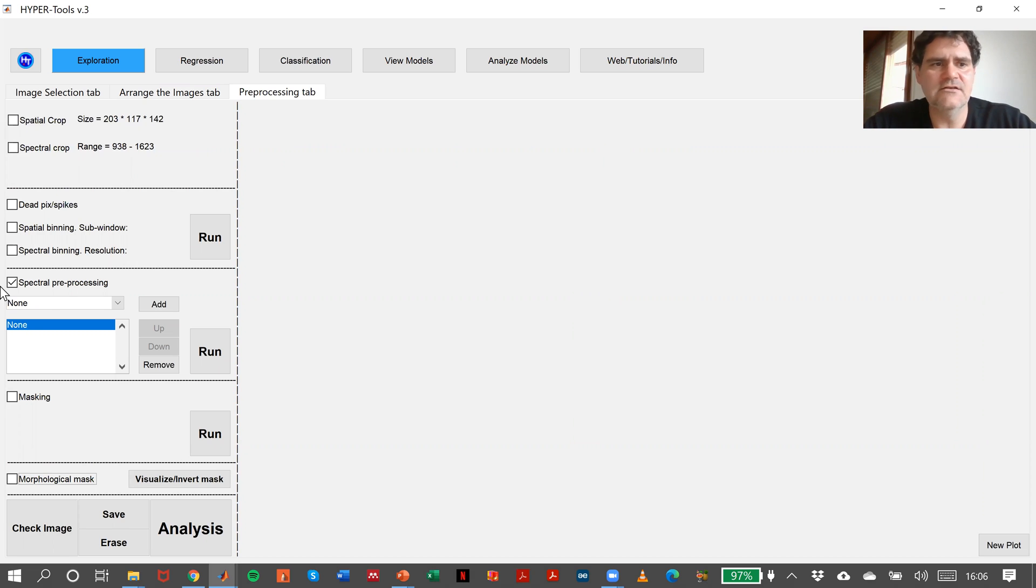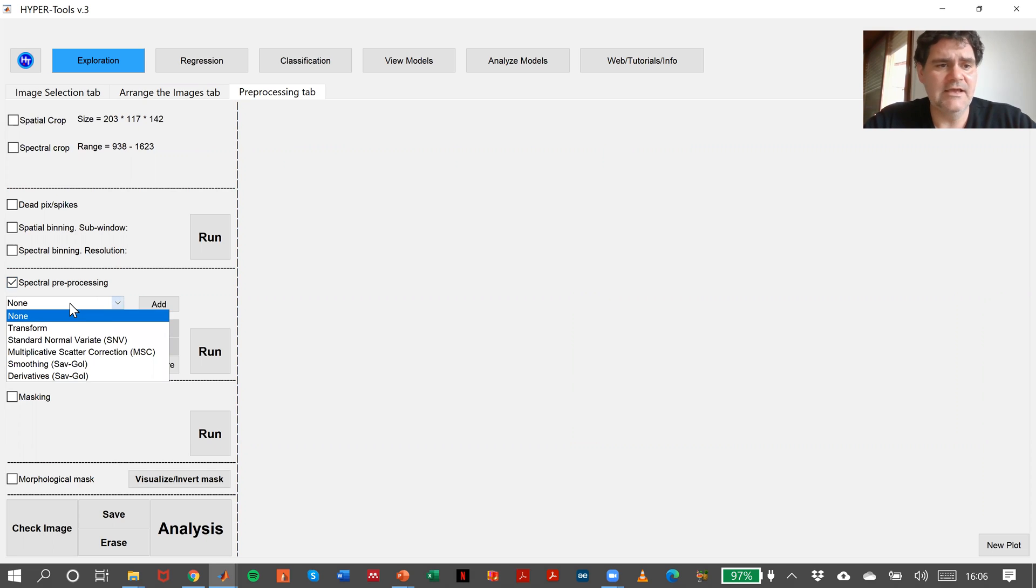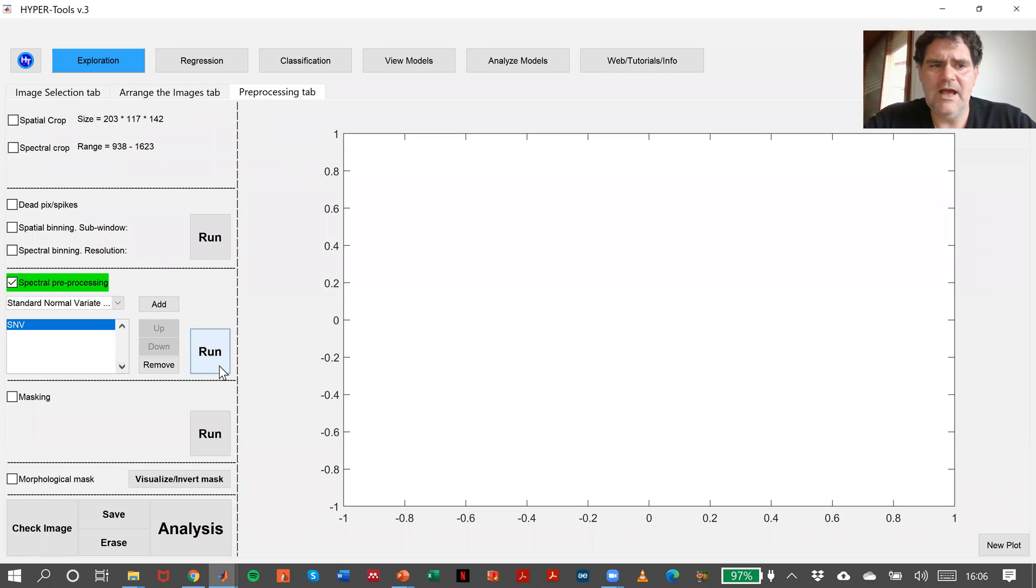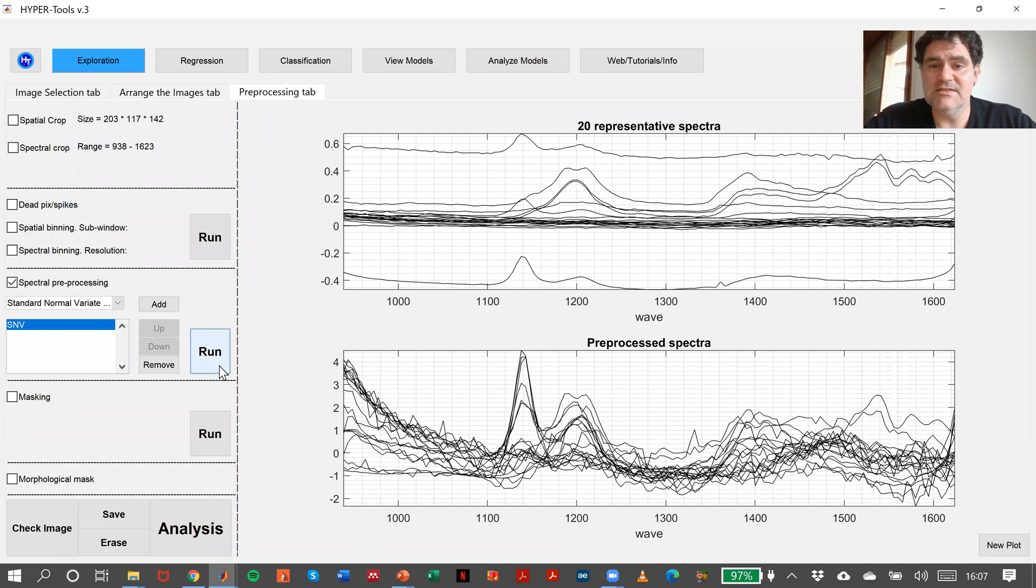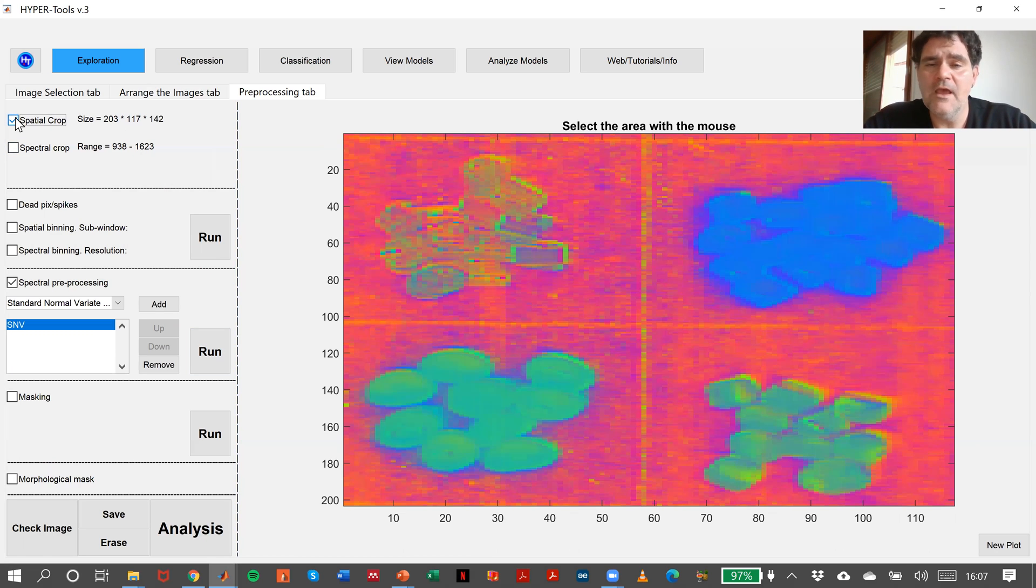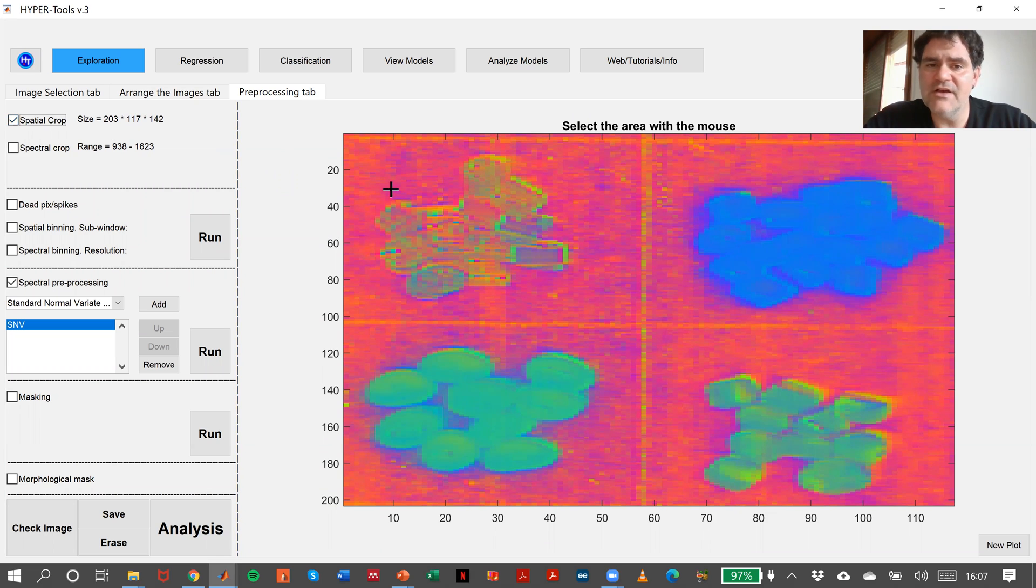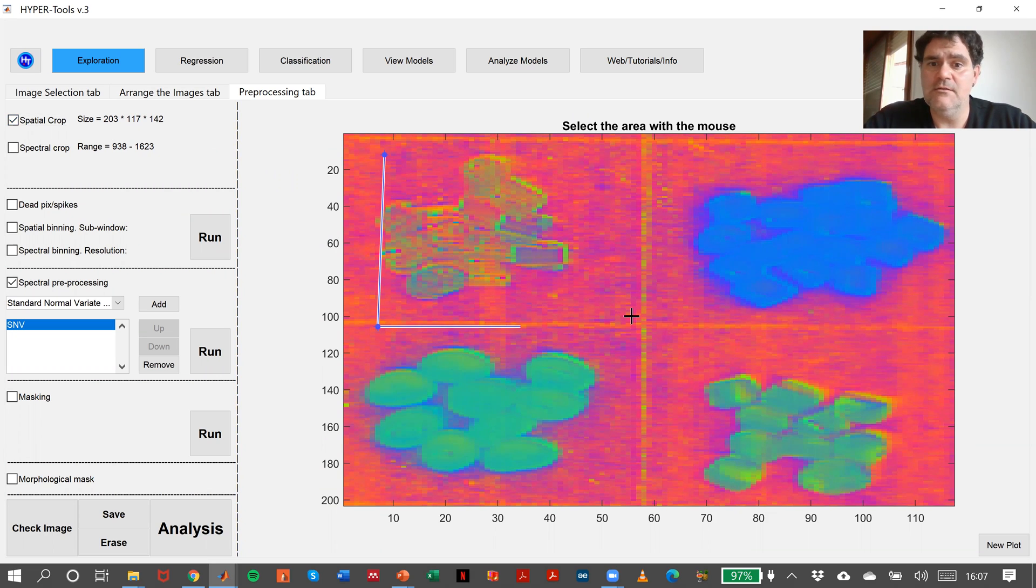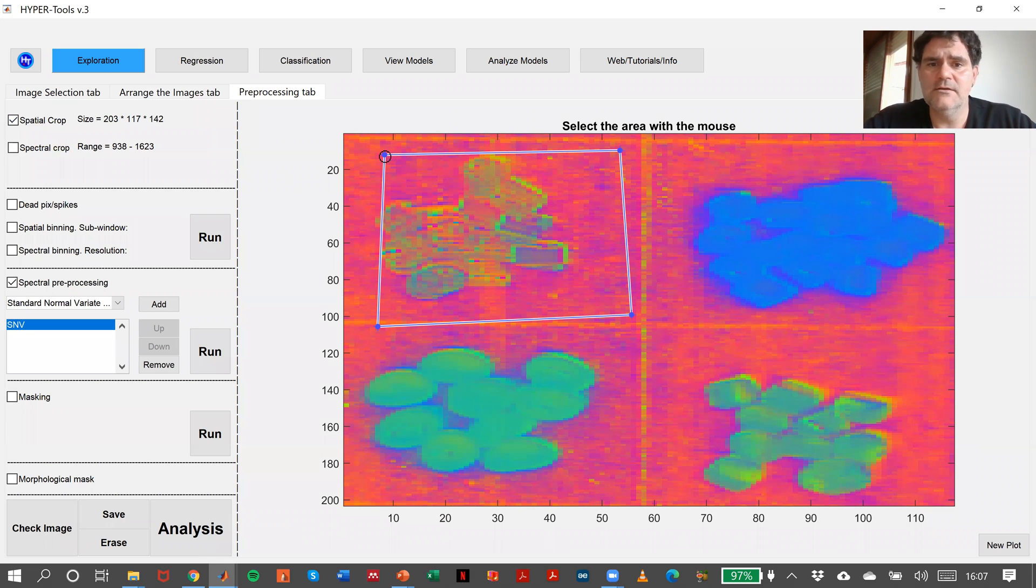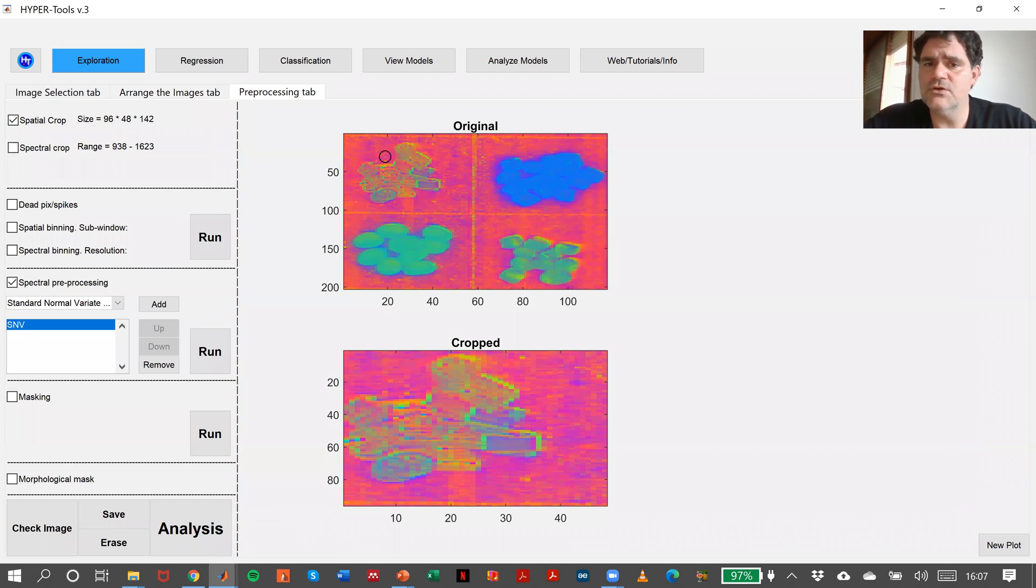In this case, imagine that I want to make a preprocessing like SNV. I will apply SNV to the spectrum of my image and then I want to make a spectral cropping or a spatial cropping. I will do the spatial cropping on the image with SNV as preprocessed methods. So I will be using this image.